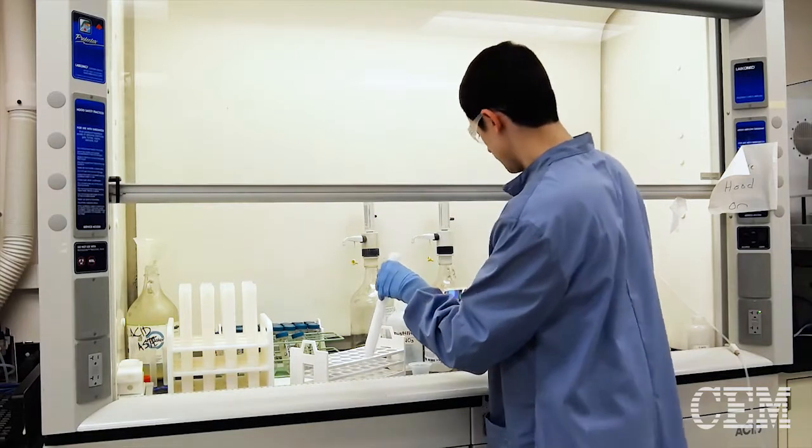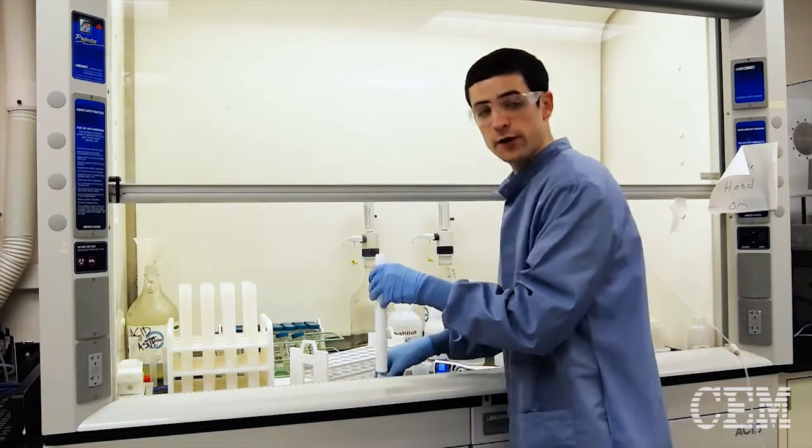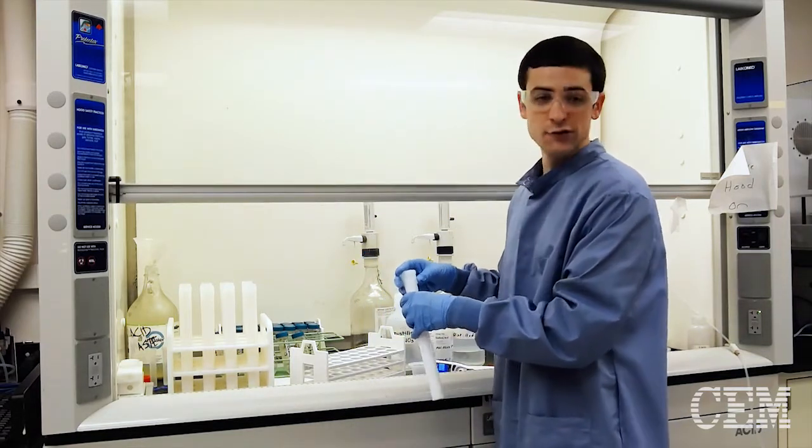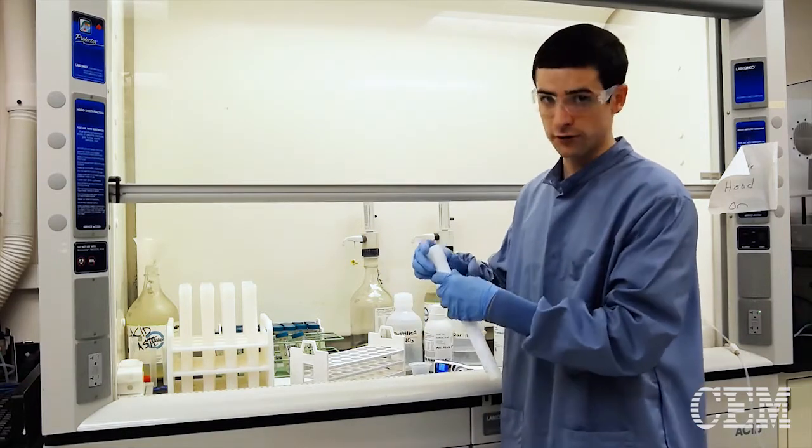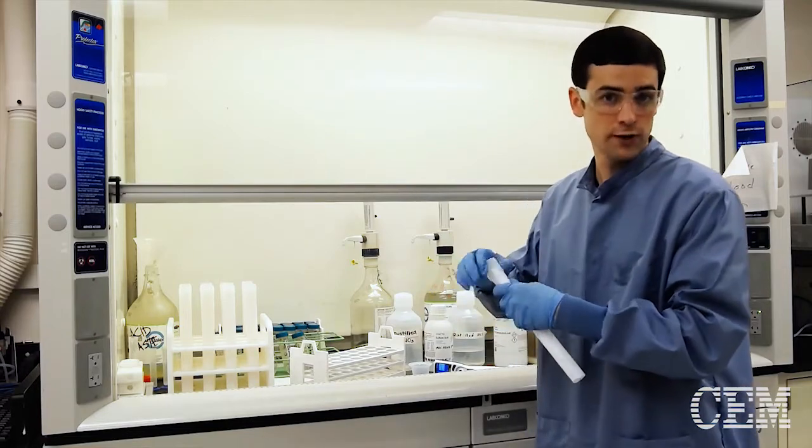If you're having to use 15 mLs for your digestion, go ahead and use 15 mLs to clean, too. If you're using nitric acid for your digestion, use nitric acid to clean. If you're using aqua regia, use aqua regia. Use the acid that you're using for your digestion to clean with.